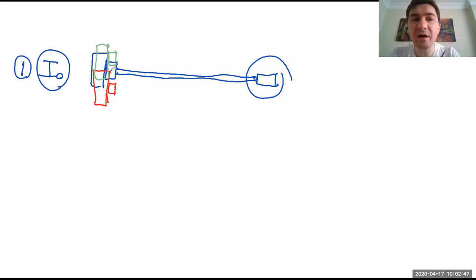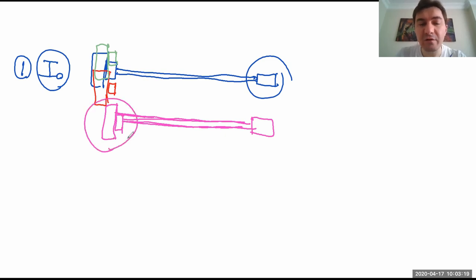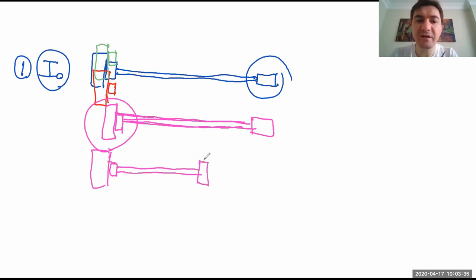Right? So sometimes it is like this. We have an X-ray beam and the detector is staying like this. So what you see here, some part of the X-ray intensity goes to the detector active area, but some part does not. So then the position of the detector must be exactly at the right place. It must be like this. The whole produced X-ray intensity should enter into the active area of the detector and we should see that direct beam. So this is the direct beam.